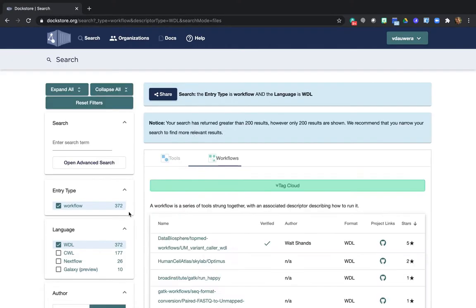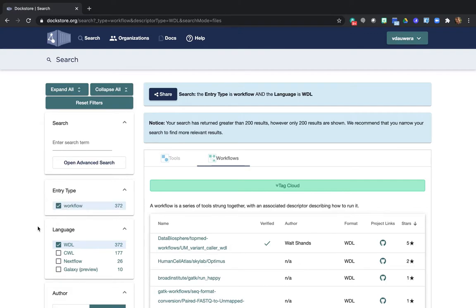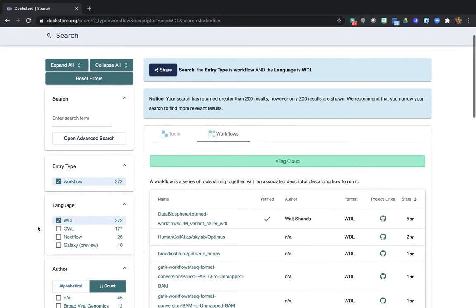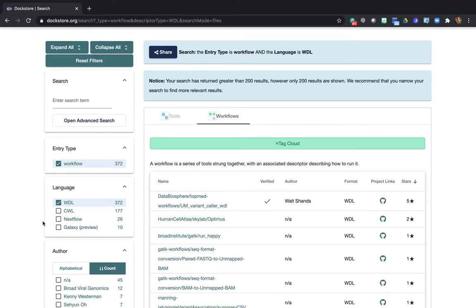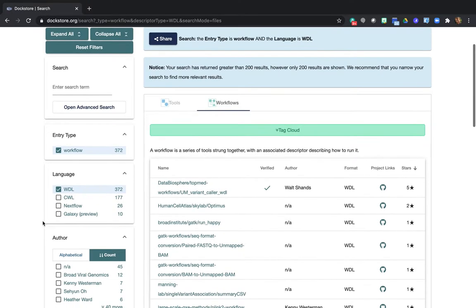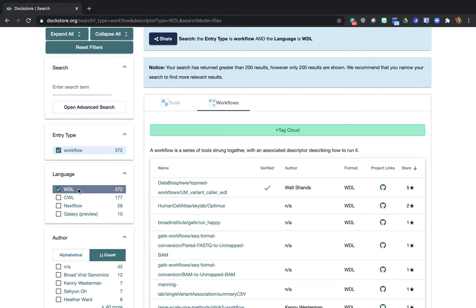And you'll notice that this takes us to the Dockstore website, so we're not in Terra anymore. But don't worry, we'll find our way back. Now, as you can see here on the left, the system automatically selected some filters to have Dockstore only show us workflows that are written in the workflow description language called WDL, which we pronounce WIDL because it's easier to say and it rhymes with funny things.